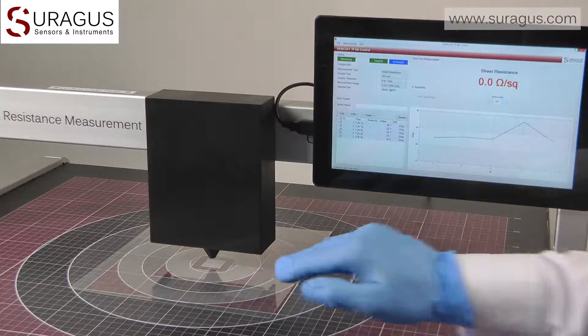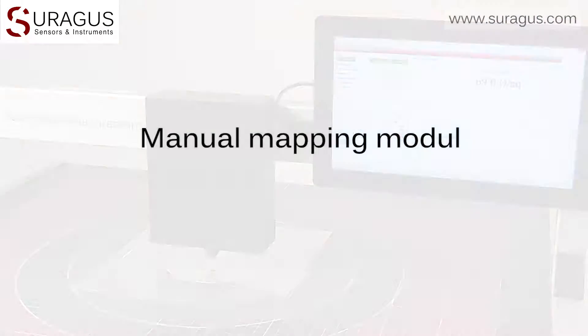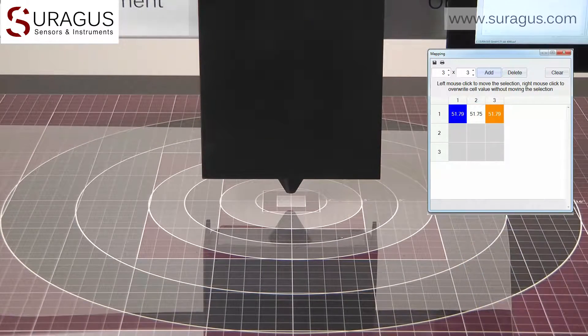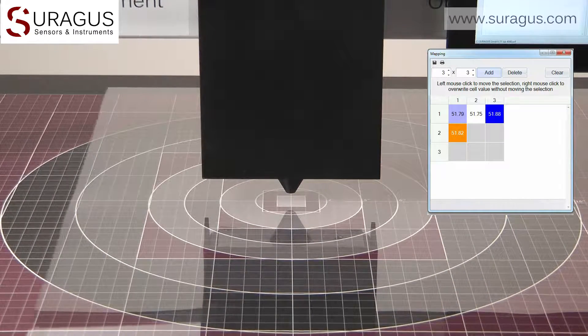As you see, the measurements are fast, accurate and well reproducible. The included manual mapping module allows to take multiple measurements on one sample and to assemble them in a sheet resistance map.